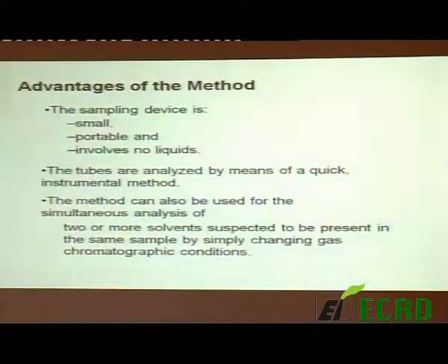Next. There are some sampling advantages. The sampling device is small, portable and involves no liquid. The tubes are analyzed by means of a quick instrumental method. The method can also be used for simultaneous analysis of a number of solvents present. Next.